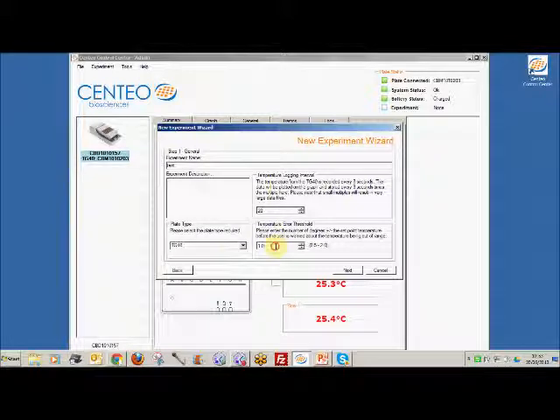The other improvement in the system is if you're only interested in controlling the temperature within 0.5, then you can have a warning limit set at 0.5. If you're really not so concerned about temperature, you can expand those limits. I'll put that back at 0.5.